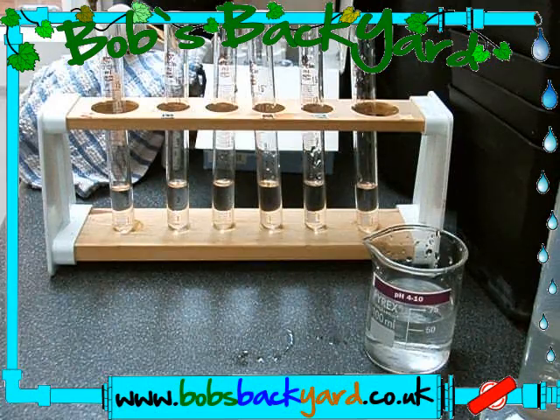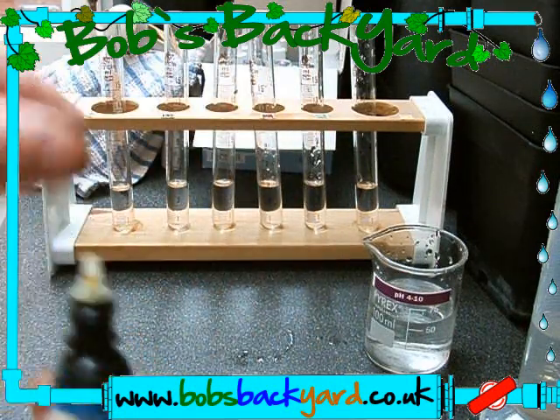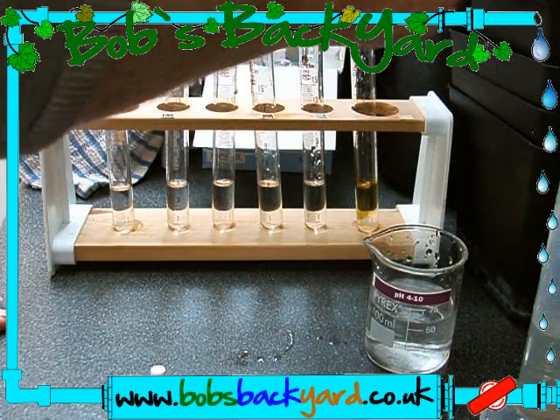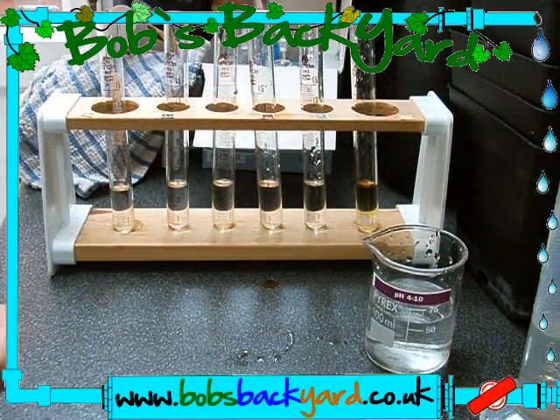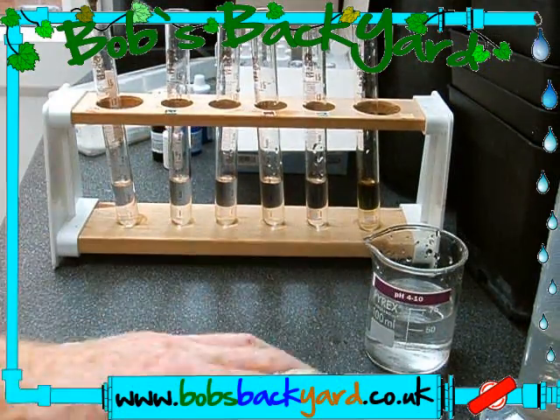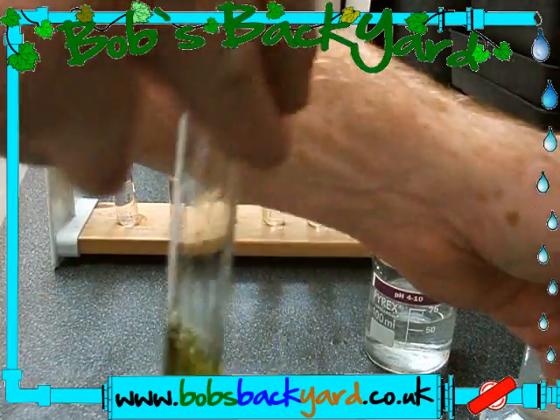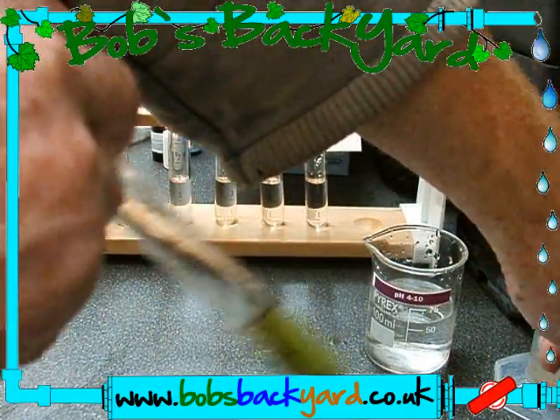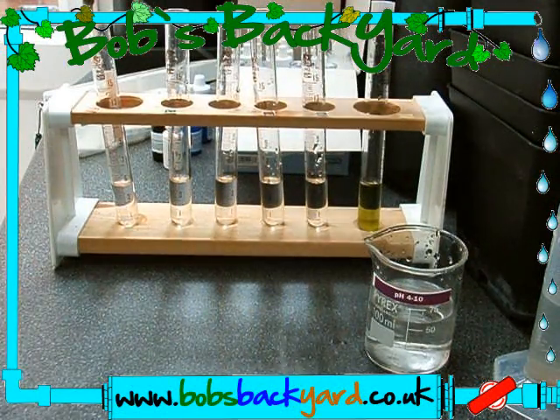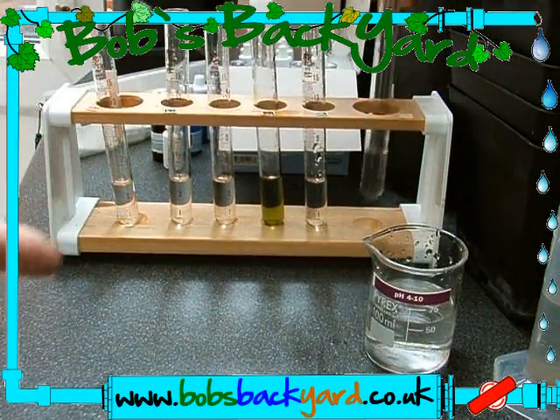We'll start with the simplest — just a pH test. This involves putting seven drops of the reagent into a test tube: one, two, three, four, five, six, seven, and one on the table for good measure. Give it a mix — don't have to go too crazy with it — pop a top on and let it develop. I'll label it pH so I don't get confused.